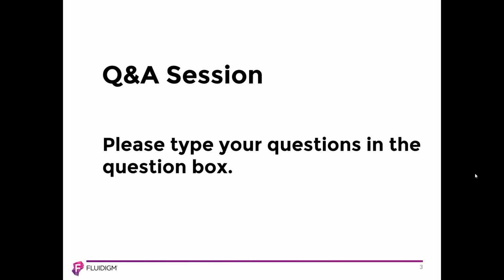The next question that came in is asking about analyzing IMC data, and specifically they said, could you highlight some of the steps in analyzing your imaging mass cytometry data? Sure, so to answer that question, we'll start with a little bit about our pipeline. We have it in 3 steps. Once you have your data acquired, we take a look at it using our MCD software, and then the next step is to segment our images. And cell segmentation is an analysis technique, and it's required to identify your cells on an image. And this is essential because it's going to allow us to perform quantitative single cell image analysis on your data.